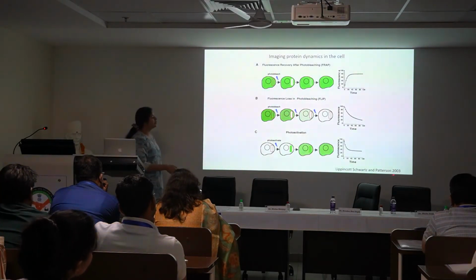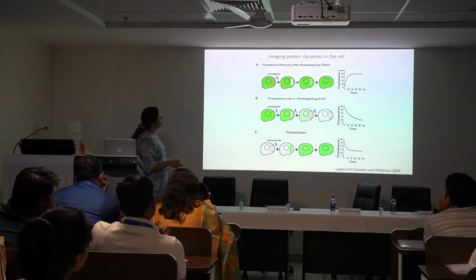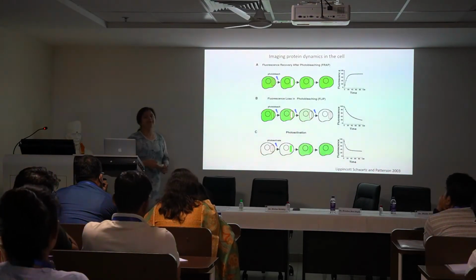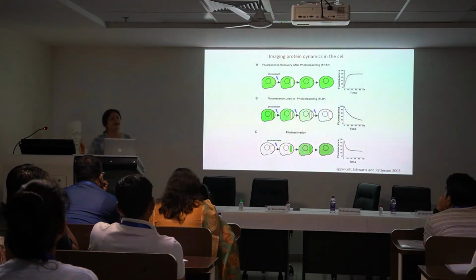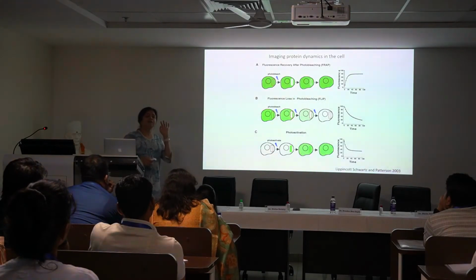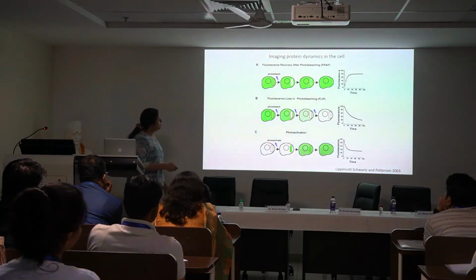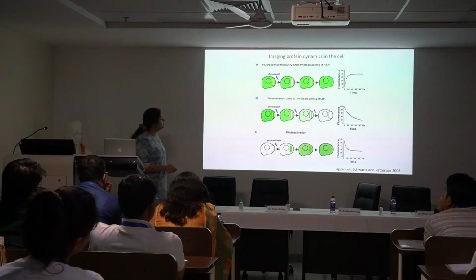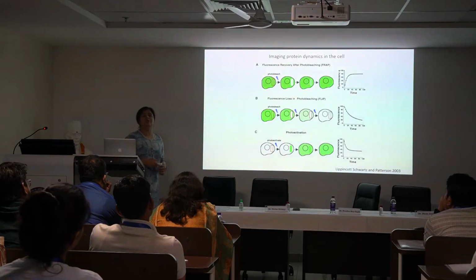So this was developed by George Patterson in Jennifer Lippincott-Schwartz's lab. And what he did was, he basically improvised on a particular facet of GFP, which is that under a certain set of conditions, this is actually the wild type GFP, which is found in jellyfish, had the ability to undergo photoactivation. Alright, so what do I mean by photoactivation? So if, for example, we take a UV laser, we shine it on the wild type GFP in a particular location, then it suddenly gains fluorescence.